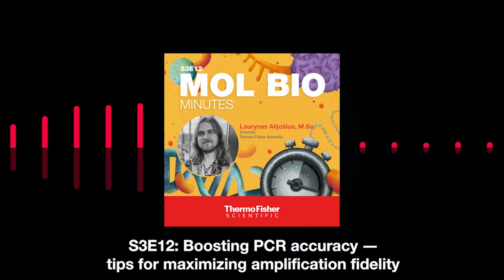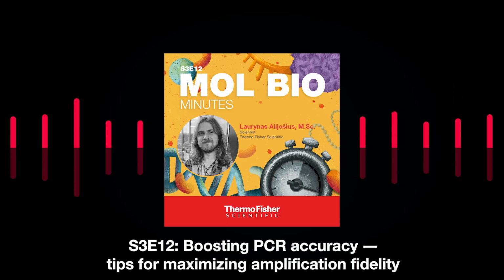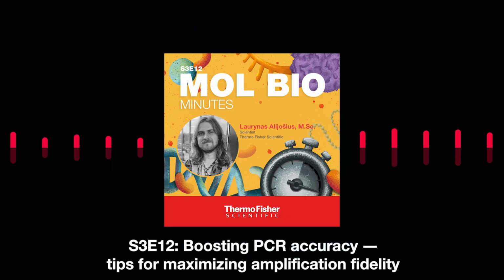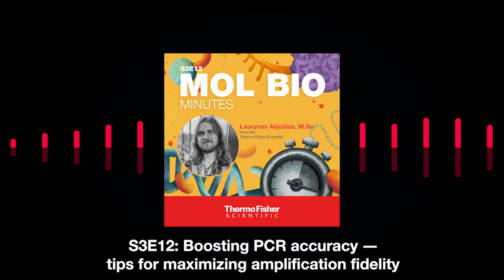But what can we do to improve all this? So, okay, the best is to address these factors one by one, in the same fashion that we talked about earlier. So let's say your DNA polymerase is a low fidelity type, or your polymerase doesn't have the proofreading activity that could fix errors.